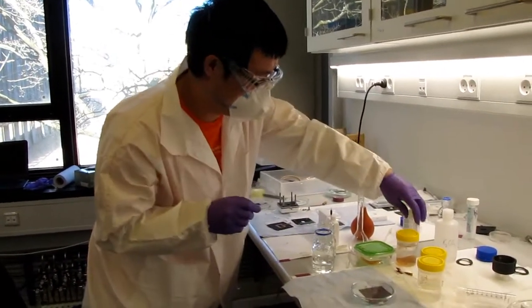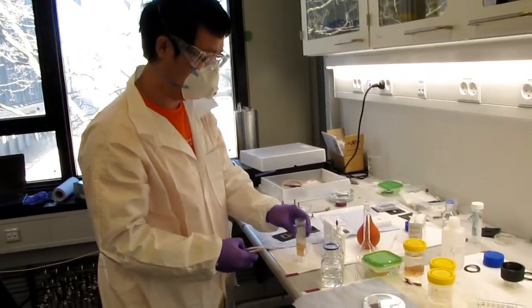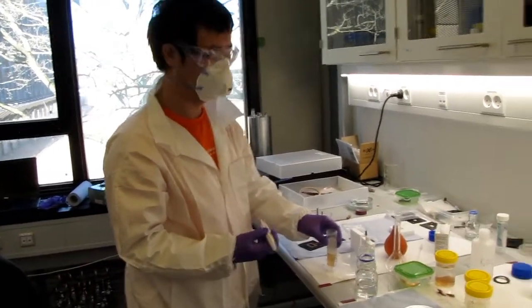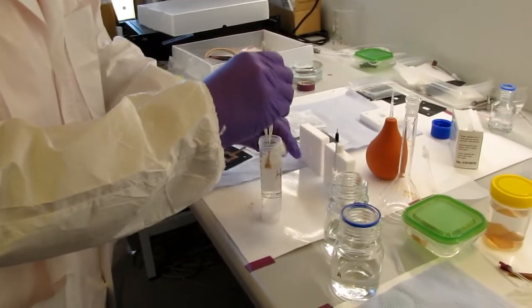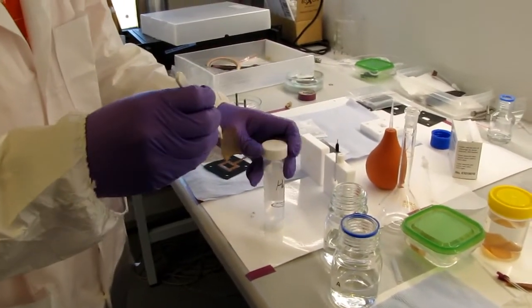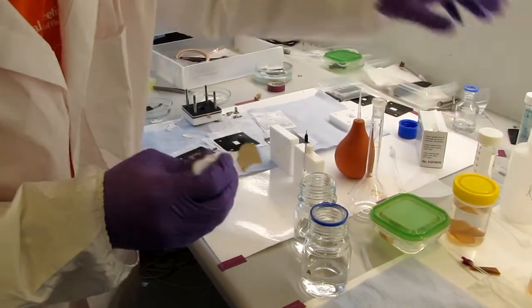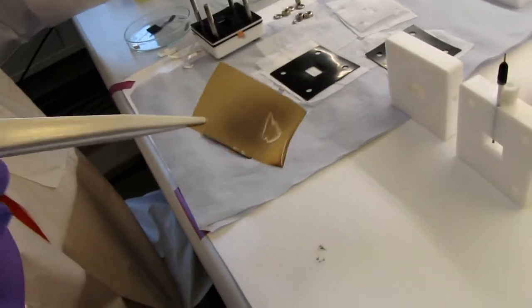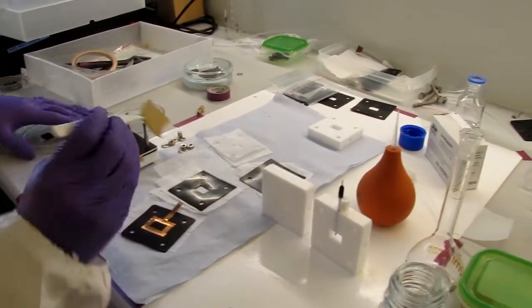Now start with the membrane. And why are you not measuring liquid products? In this case there's not enough time, you know. Only a 3 hour experiment. They cannot learn the whole method. Just do the simple experiment. This membrane, yeah, looks like it's already hydrated.